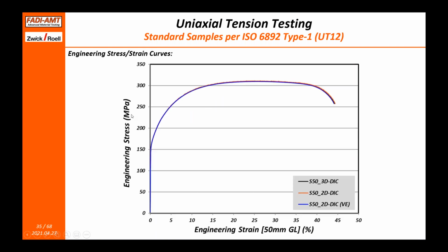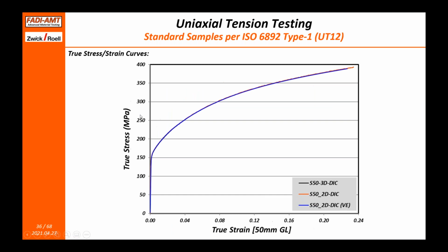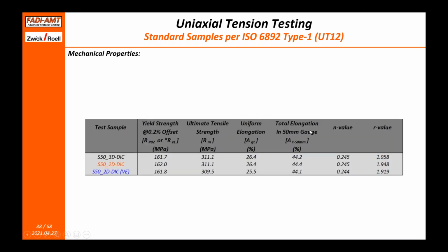But we've shown here that first you can get the full true stress strain curve, the R values, and in terms of hardening parameters, if you see in my table, the N value is basically the essence of the work hardening parameters, and we got the N value for it here. You should be able to obtain a very good N value for your stainless steel. Even though the N value goes to about 0.4 or 0.45, it should be no problem because we've used the same techniques with other types of steels with 0.3, 0.35, and 0.4 N values. So it should be doable.